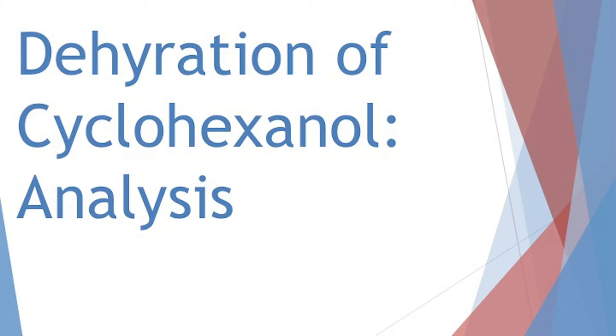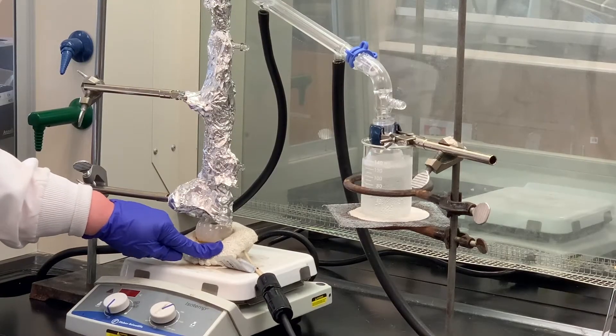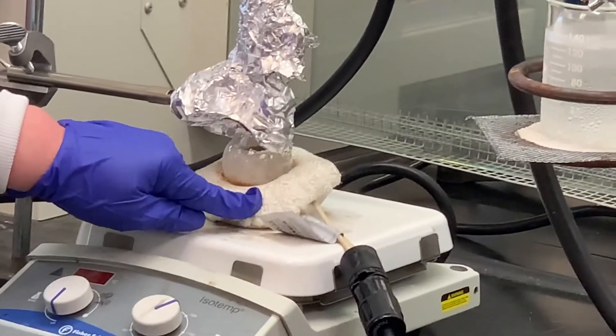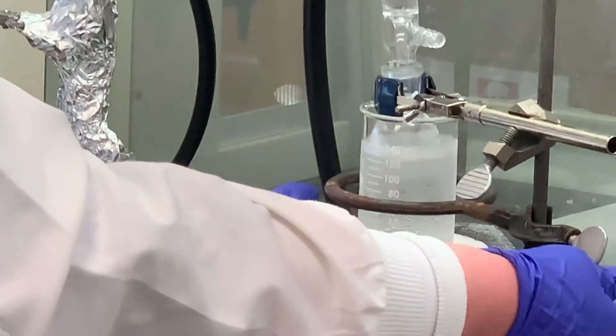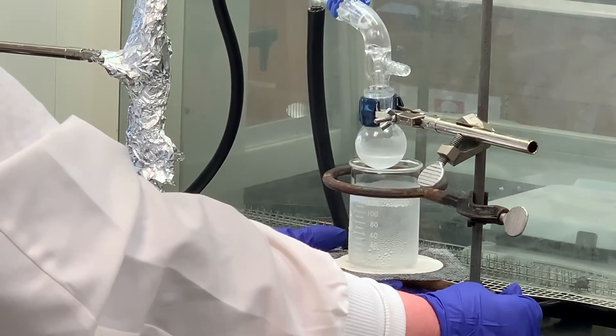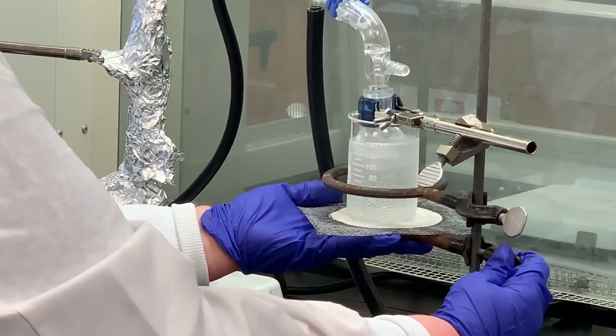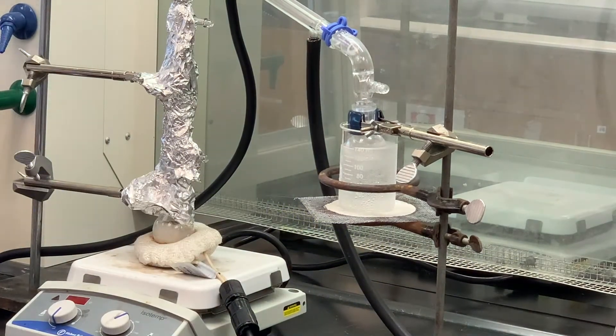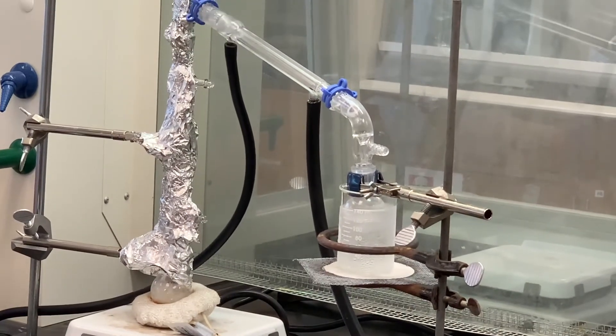Just cut the thermostat off, the variac. It's kind of hard to see with all the foaming here, but I think we'll go ahead and stop it at this point. If I lower this down, it does look like we've got a fair amount of material left in the receiving flask. Temperature was around 68 to 70°C — I really didn't get much above 70. Our goal was to collect anything below 90°C, so we're all set with that.